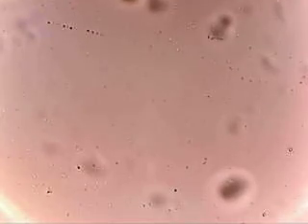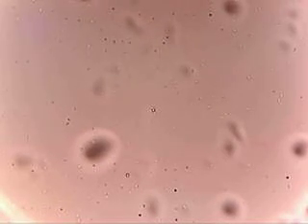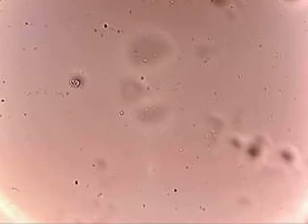And furthermore, wandering even further afield, here's another one, just a bit above and to the right of center. Now it's in center. Again, here it's got bacteria affixed to it, and here again. That one doesn't. Okay, here. I think I found the originals. There again, see that?